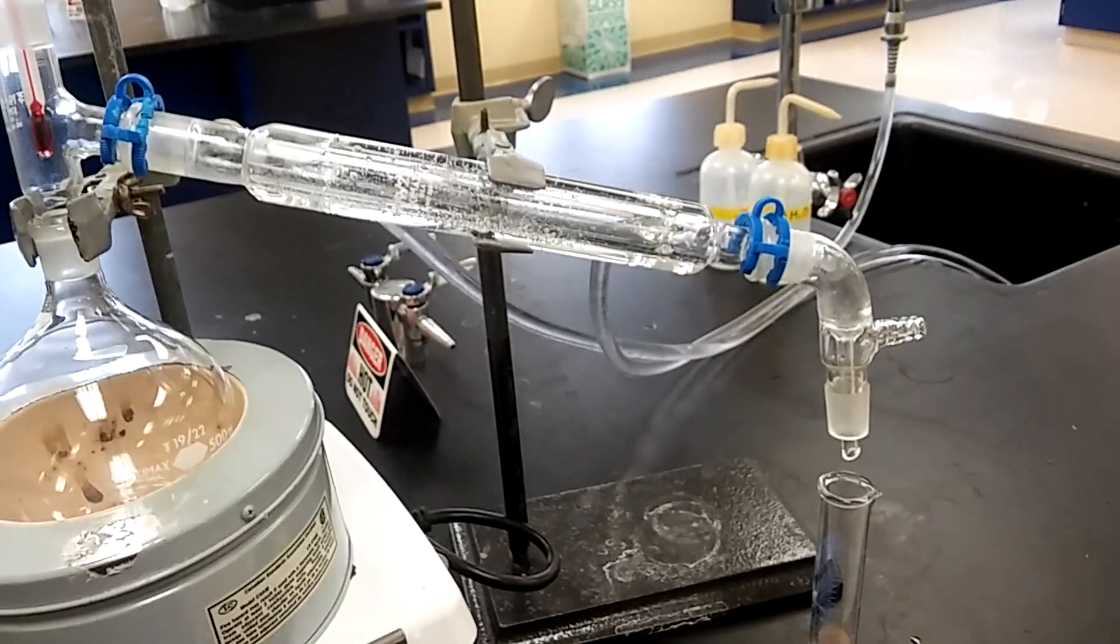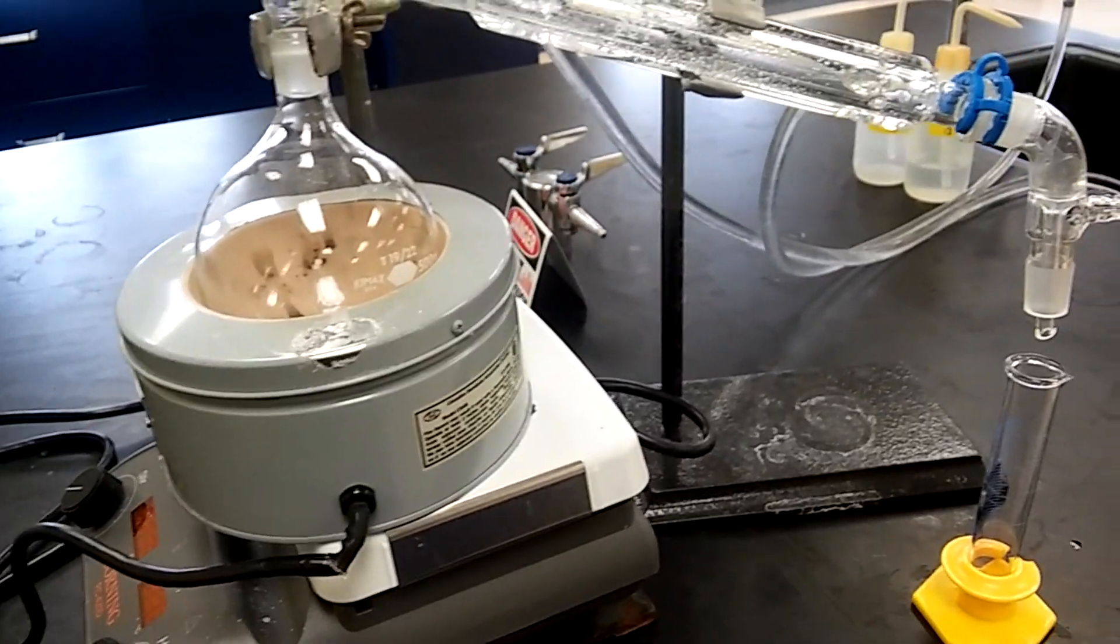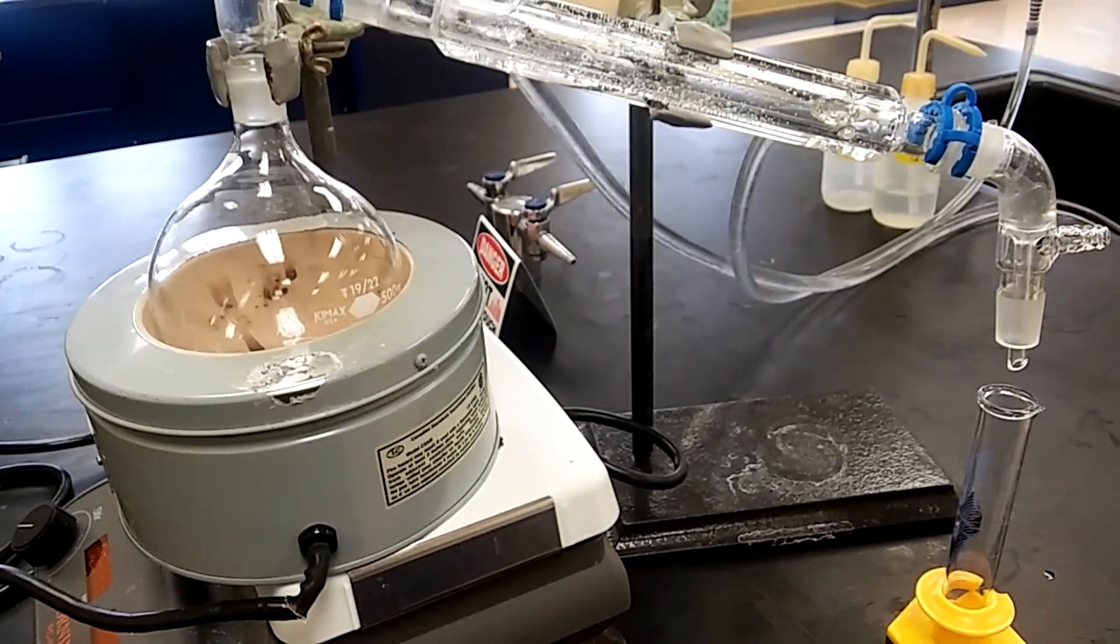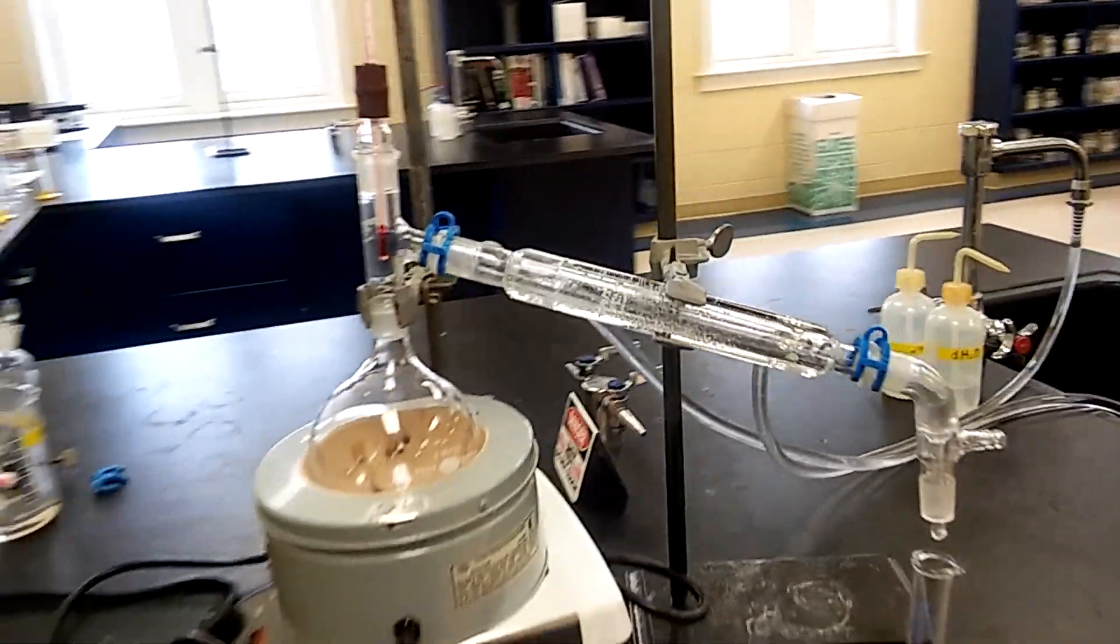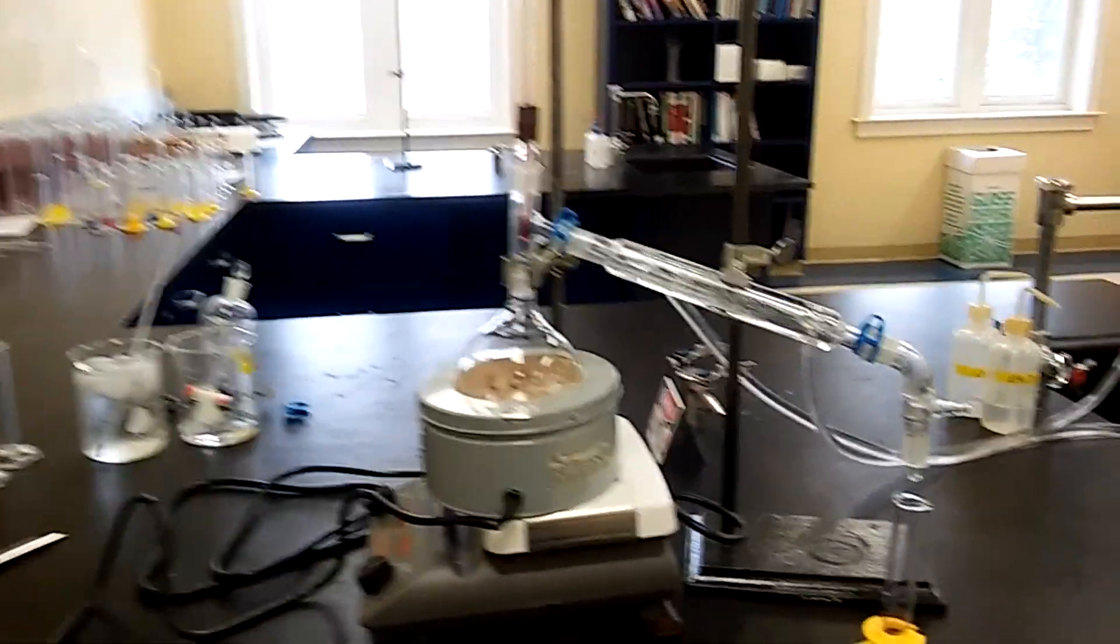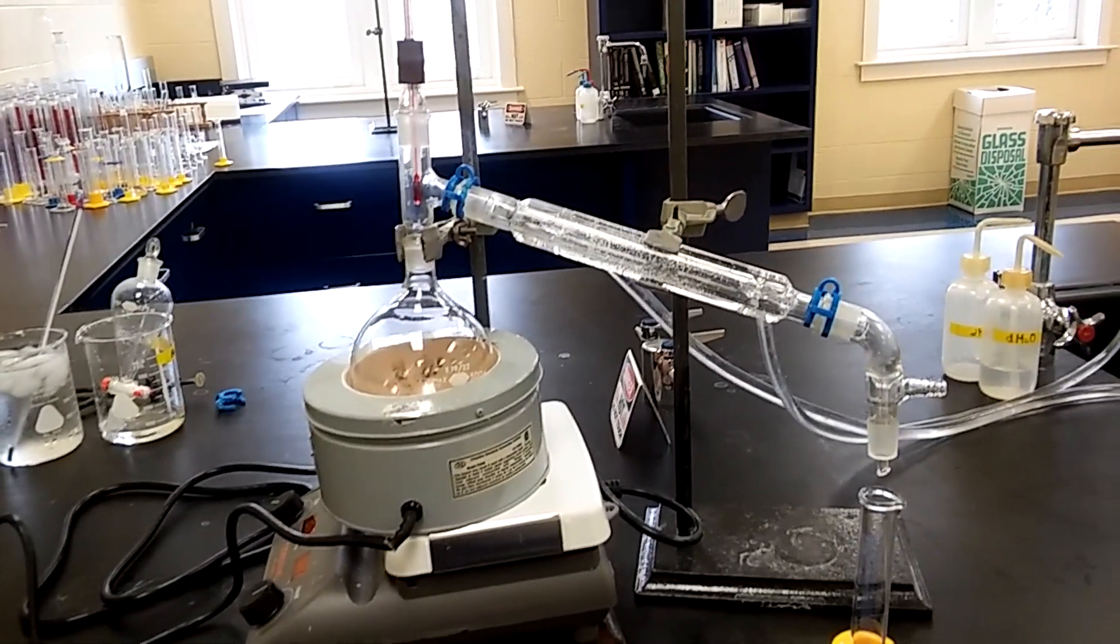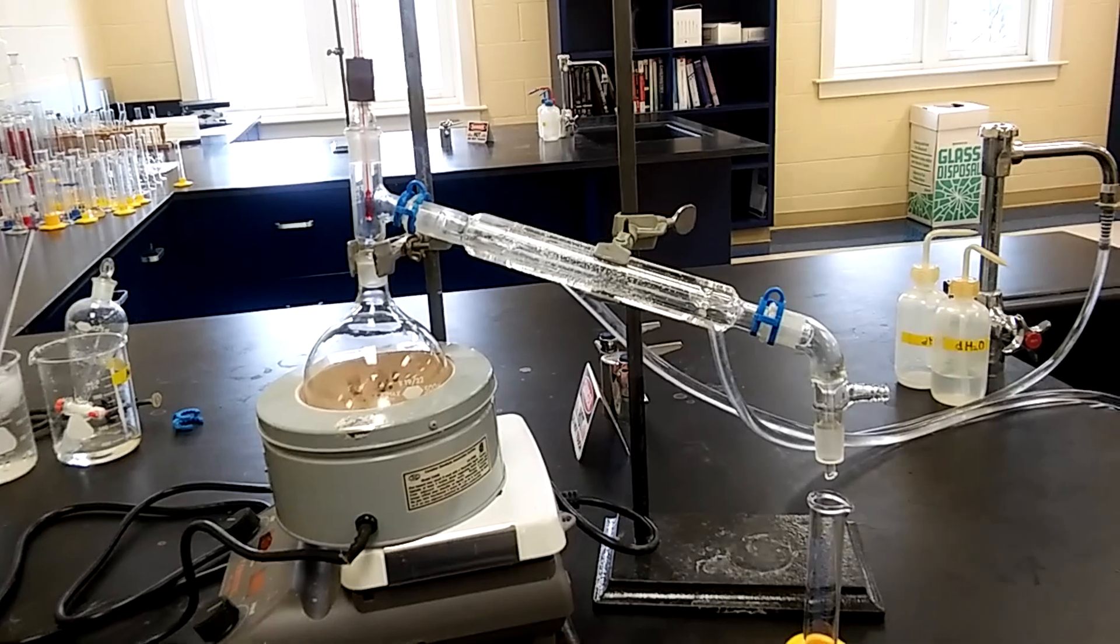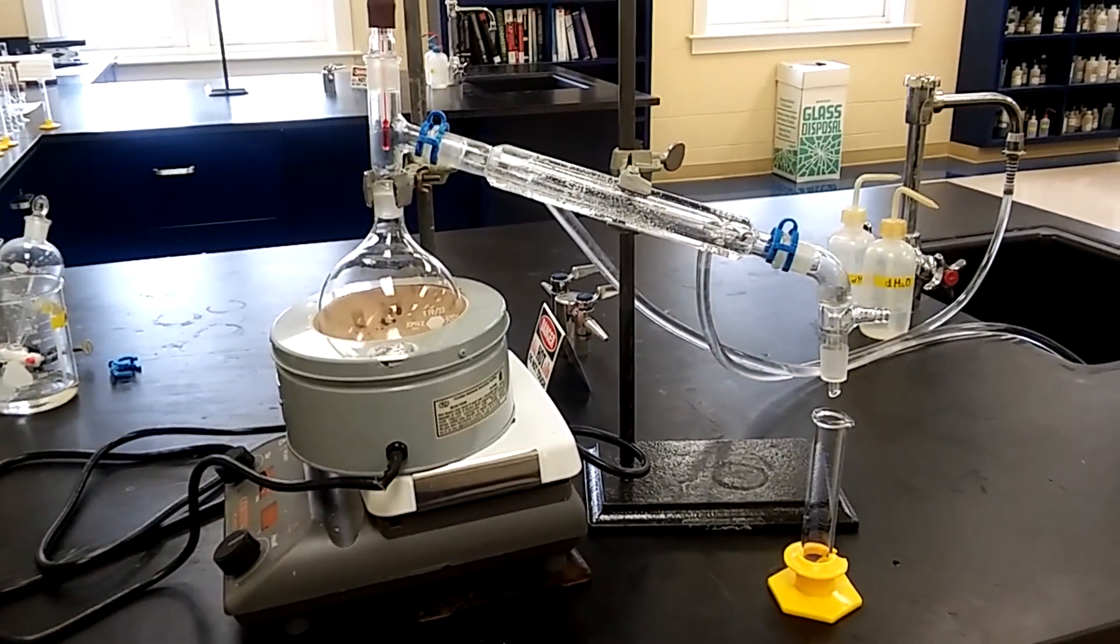Don't forget to turn on your condenser. Keep the temperature low and when you see that the temperature is about 49 to 52, start collecting your product. That's a pretty simple setup. I will come back when the product is distilling and show you the temperature and how the flask looks.